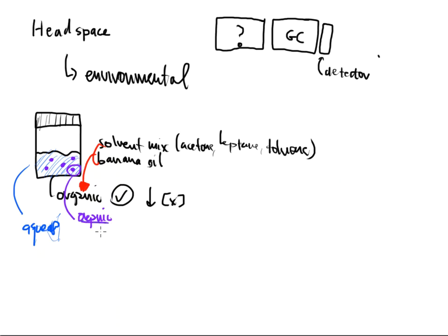So these are very suitable for a GC system. They're organic, they're carbon-based mainly, they probably are volatile or semi-volatile, they have low molecular weights, they have low boiling points, they are perfect candidates for the GC system. However, they are mixed in with this water. They're mixed in an aqueous environment.